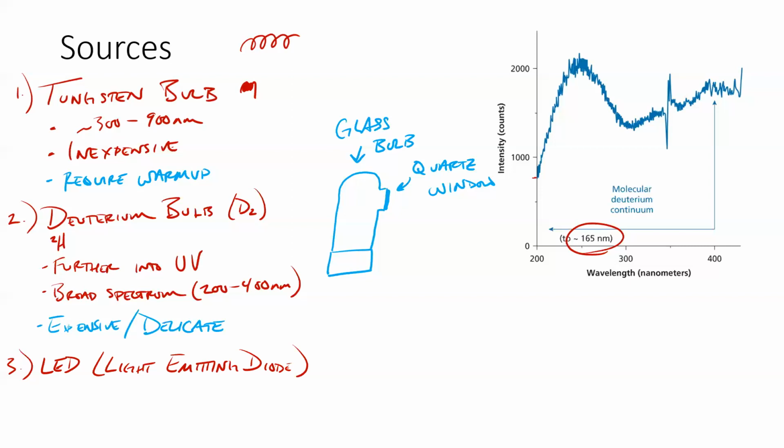As they developed better materials, they managed to make some with relatively broad white spectra. These days you can buy an LED flashlight for pennies, it seems, and it gives you a pretty nice white light. That wasn't the case 10 or 15 years ago. As these technologies improve, we're going to use them to our advantage. So these days, LEDs can be broad spectrum.